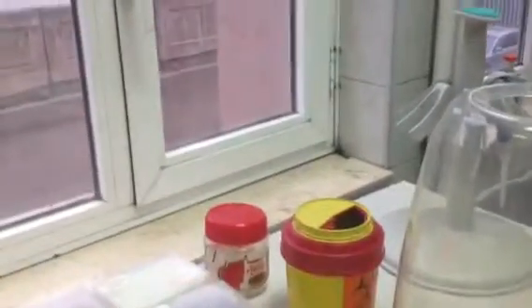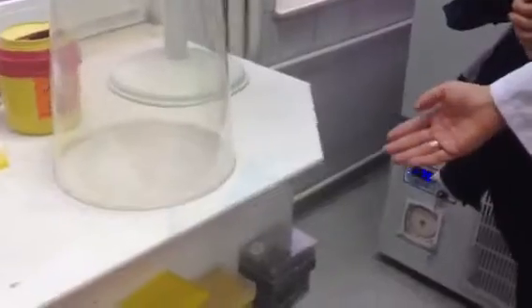It's for laboratory rubbish, and there are pipettes, for example 200 or 100 or different kinds.